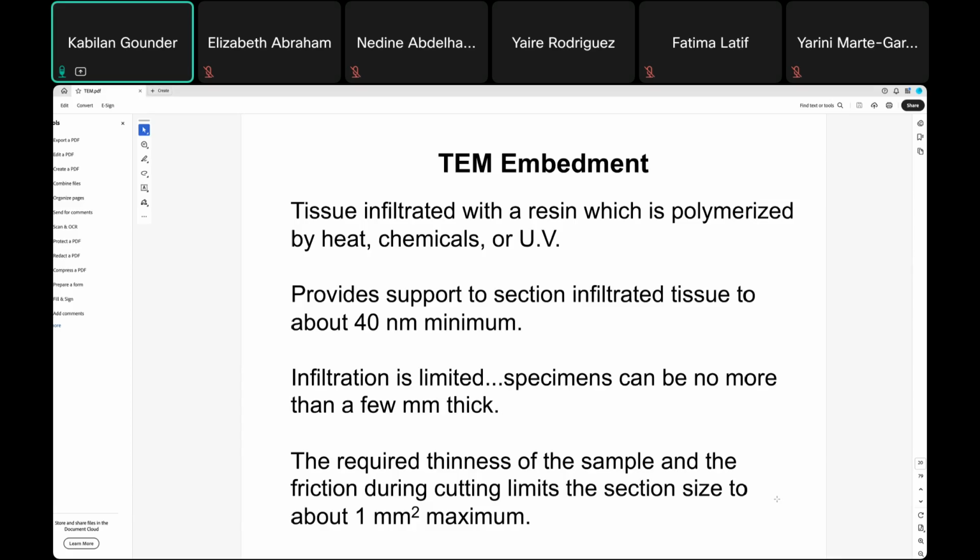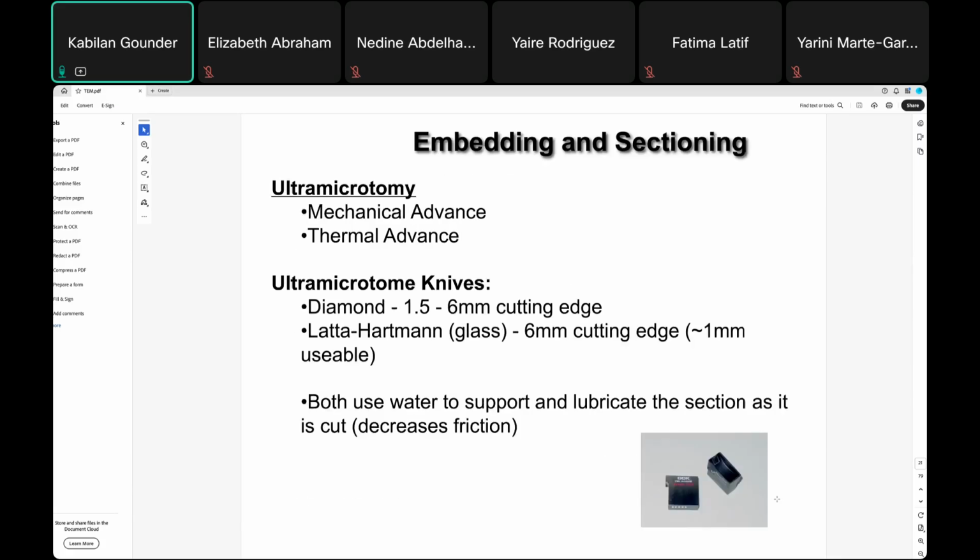So, you are already taking very small pieces as samples, but the sections you take are also very, very small. If you use a small sample, your results will improve a lot compared to slightly larger samples. So cutting is very, very important.